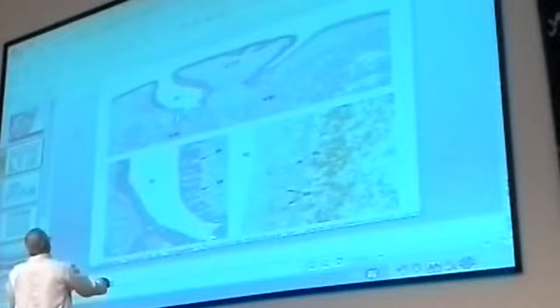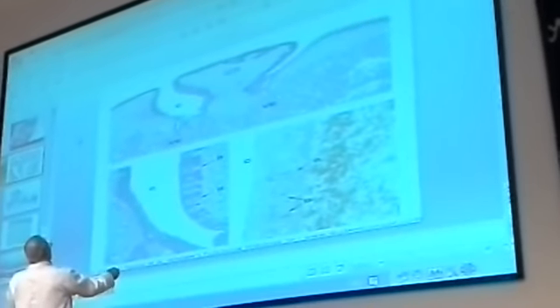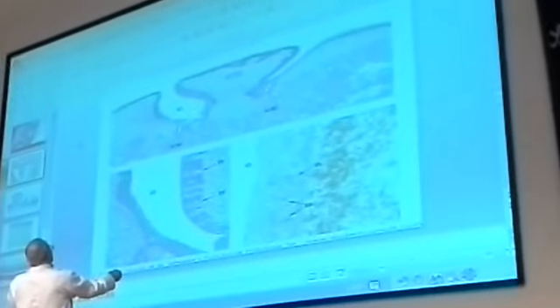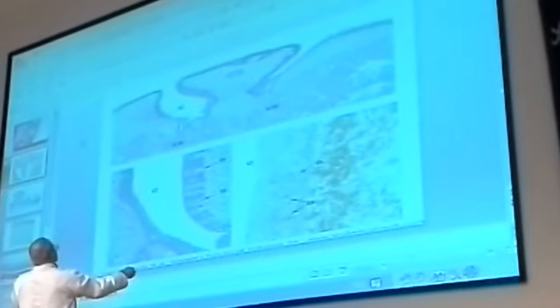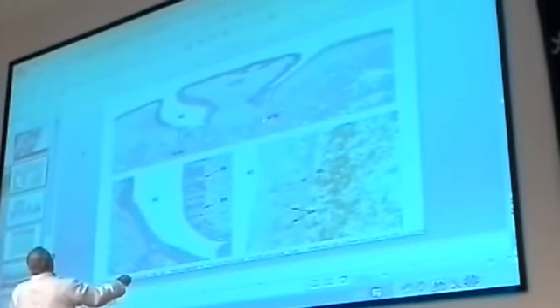Where can you find the ducts? At the sides, and they open into the base of the groove. These are the ducts of serous glands. What do we call these serous glands? Von Ebner glands.